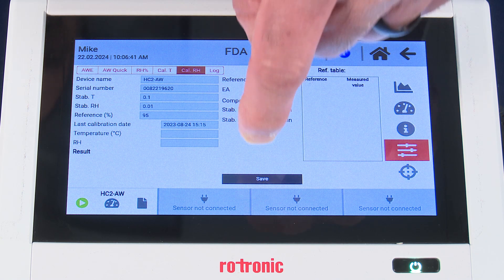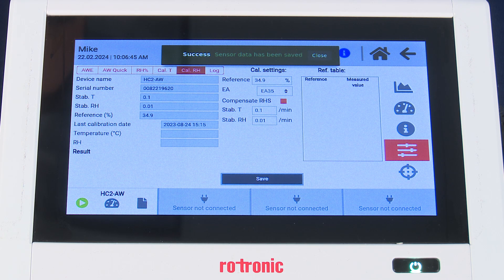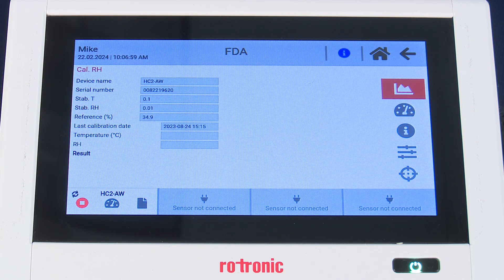Once we've made these selections, we want to save. The green bar at the top indicates we've successfully saved these settings, and at this point we are now ready to begin the measurement. We can do that by pressing the green start button in the bottom left-hand corner.